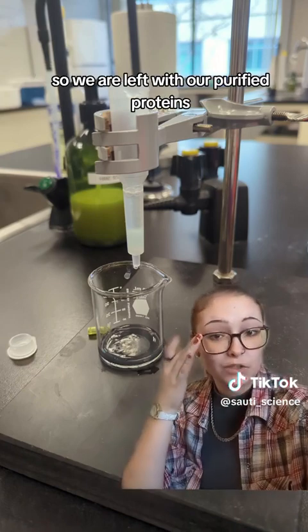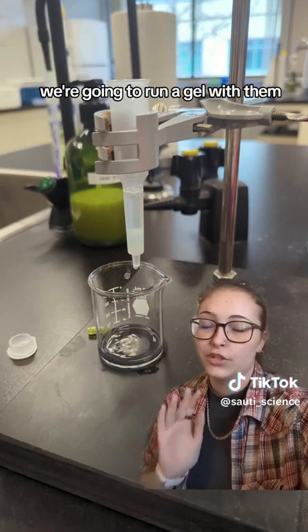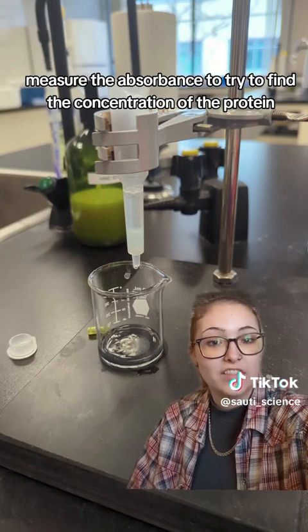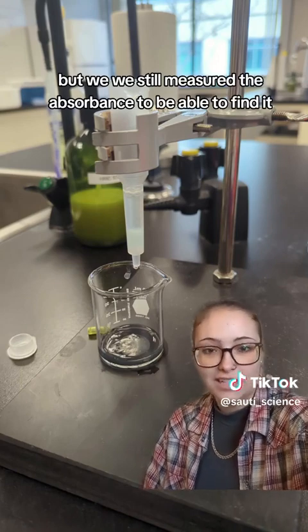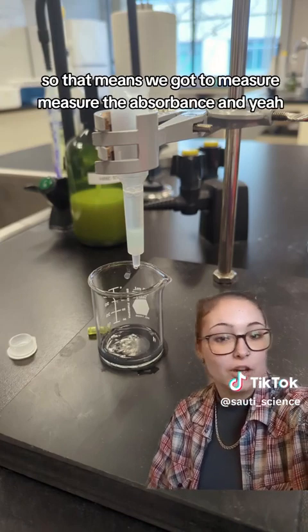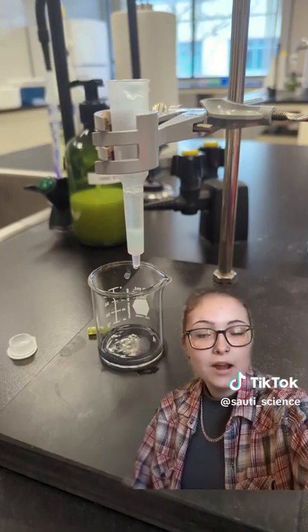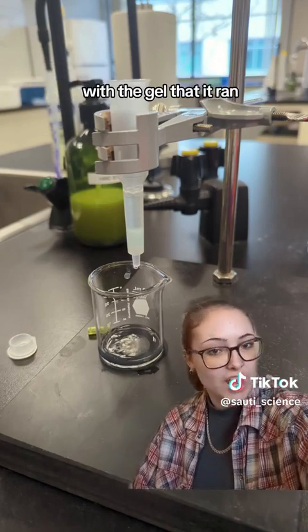We're going to use the purified proteins next week in a different lab — we're going to run a gel with them. We also measured the absorbance to try to find the concentration of the protein. I haven't actually calculated the concentration yet, but we measured the absorbance to be able to find it. Our spectrophotometer was working again, so we got to measure the absorbance. It did take a while overall, but most of it was just sitting and waiting. I'll be back with the results and everything from next week's gel lab.